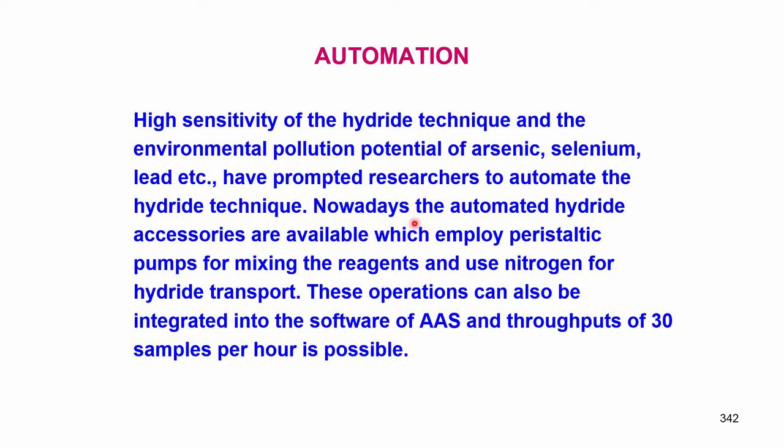So, this kind of work requires peristaltic pumps. So, you just put the sample, it will keep on generating, adding, and then taking it into the sample detector and sample holder, automatically results will come that can be analyzed and evaluated even statistically also. So, we need pumps for mixing the reagents, and then we need nitrogen for hydride transport. Sometimes what happens, the moment we add mixing reagents, we need to take it into the flame.